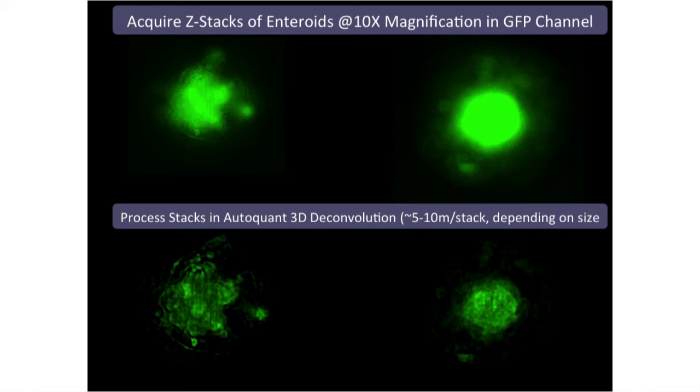This is a wide-field platform, so we're capturing all of that light, including the out-of-focus light — typically this is a confocal application. As you step through the sample, different parts come into focus at different Z planes. At the bottom, we've applied deconvolution to these 3D data sets, which simply takes away some of that out-of-focus light using a software algorithm, allowing us to approach confocal results with just a wide-field platform.